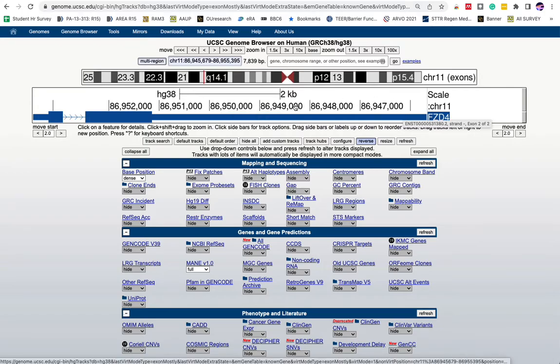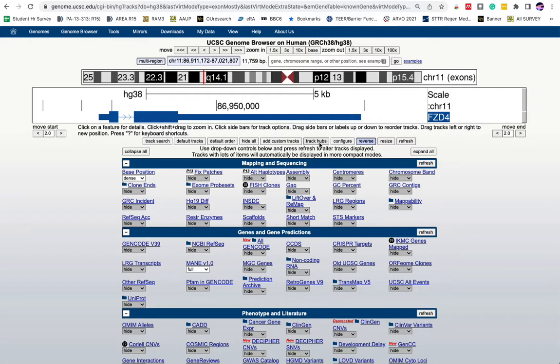I'm also going to do one more thing. I'm going to zoom out 1.5 times just so that you have a little space around the gene. I'm going to process my EV again, make sure it looks good. So basically there's a good ideogram here of your chromosome, and there's the graphic of the gene.